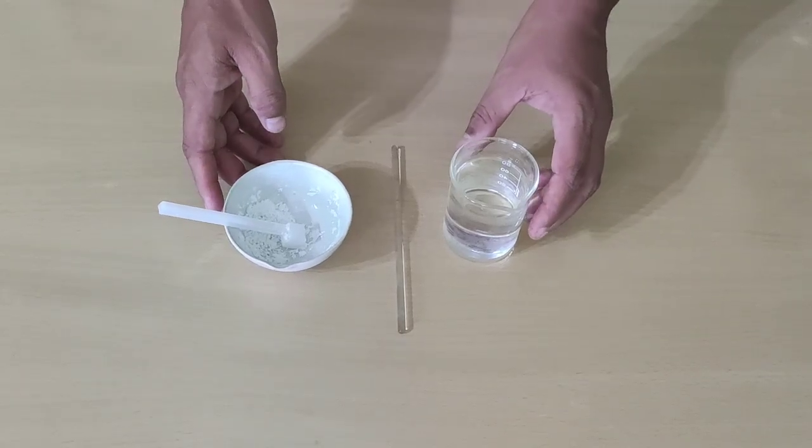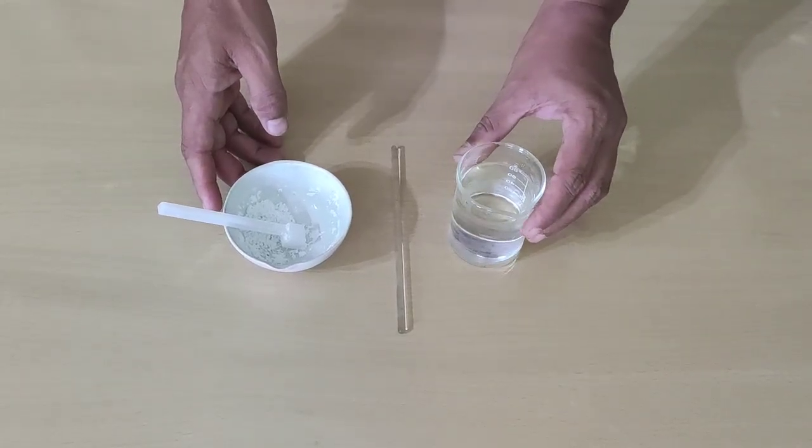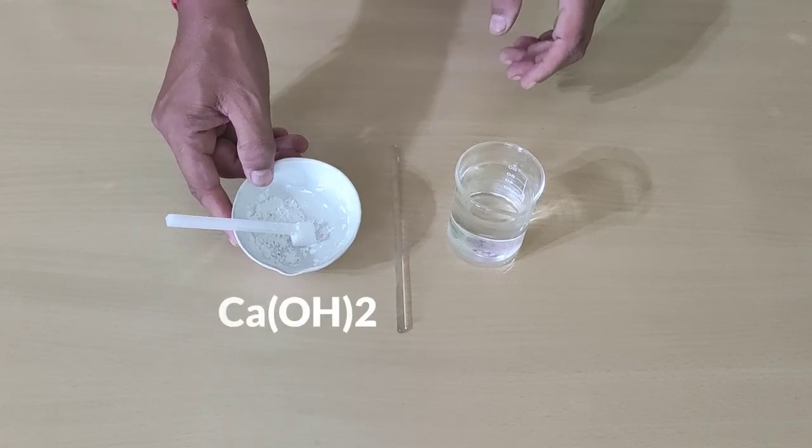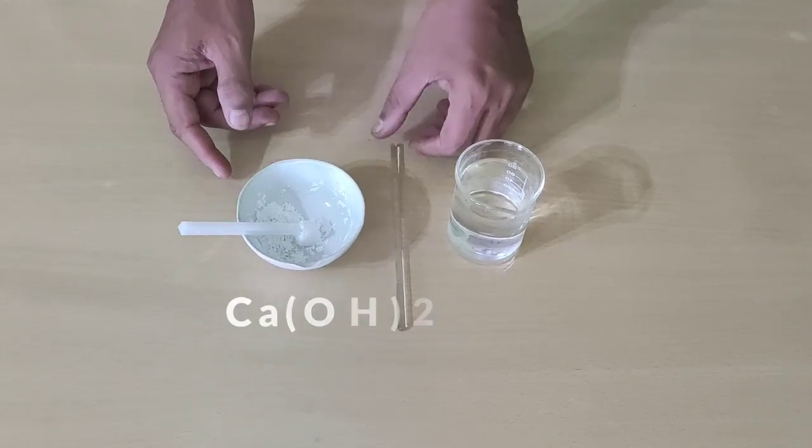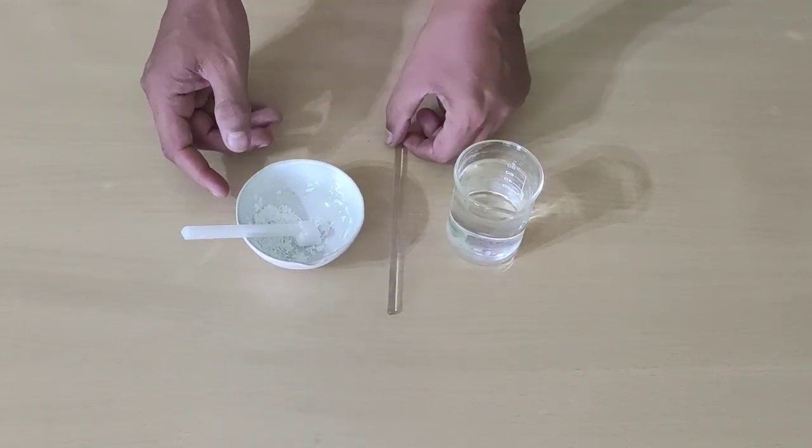Today we will prepare lime water. For preparing lime water, I have taken tap water in this beaker and calcium hydroxide powder in this china clay bowl and a glass rod for stirring the solution.